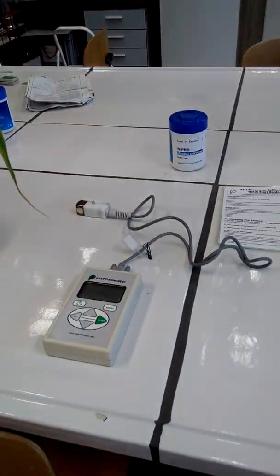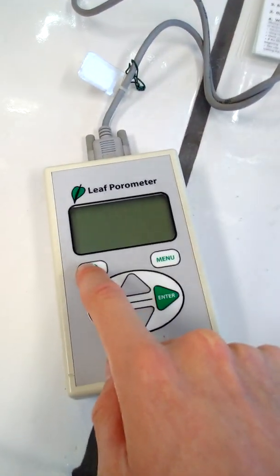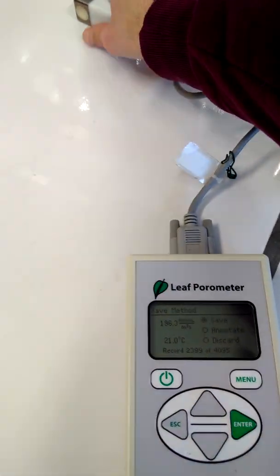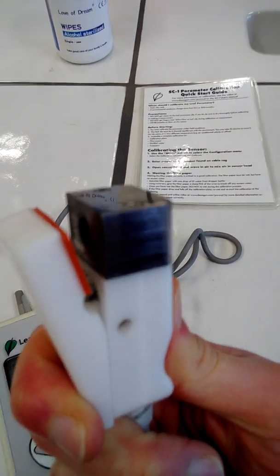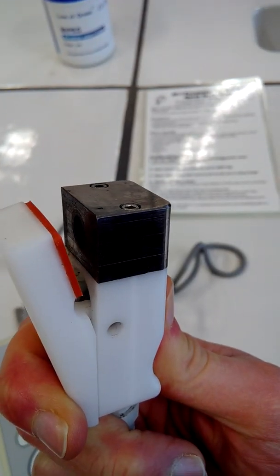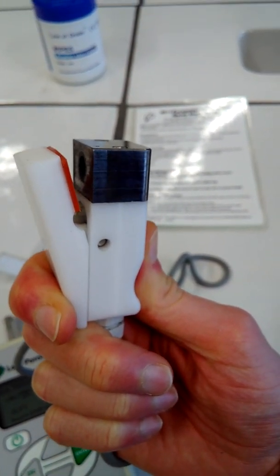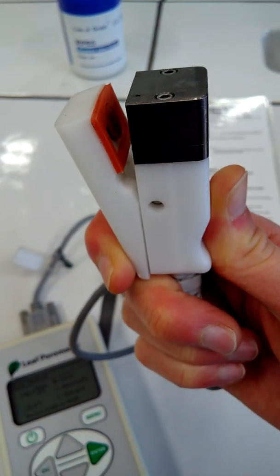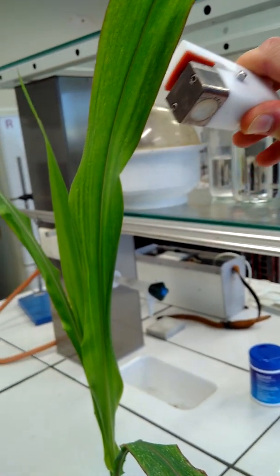Okay. Having said that, we can start doing some measurements, and I can show you the basic principles of a porometer. So that's how you turn it on. Nothing special here, I think. With this we will do the measurements. You see on the right, on the metal side, there is a hole in it. That's actually a chamber in which the measurements will occur. The other side is just for holding it. Later we will put this over a leaf.